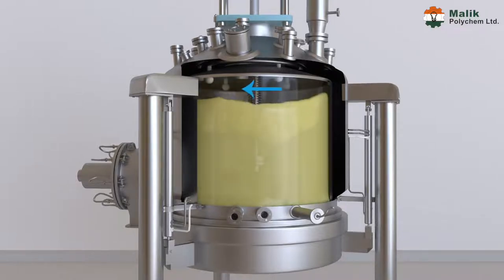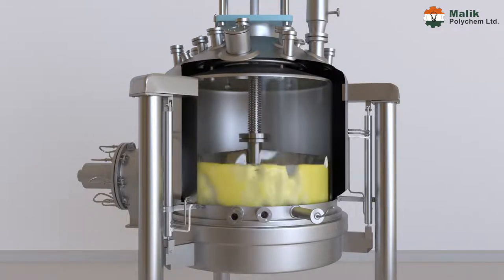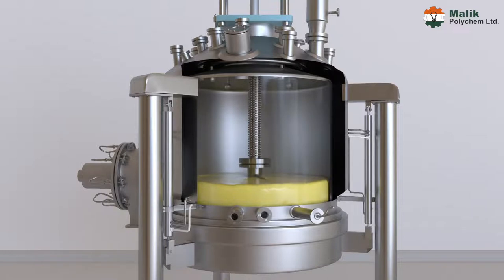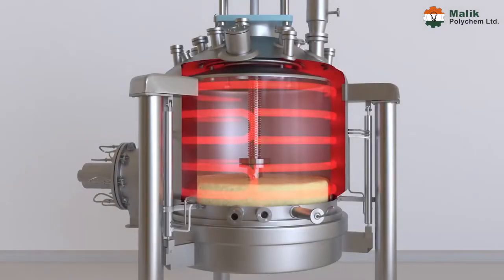Second stage — washing: after deliquoring of the slurry, cake is washed through the washing ring and spray ball, which decolorizes the product and frees it from mother liquor. During washing, the agitator is rotated continuously in a clockwise direction to remove the washing element and make successive layers of cake.